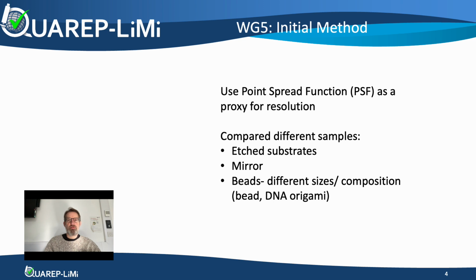Since we decided to use such a measure to follow resolution, in line with the published confocal ISO, we have tested different samples to identify something that would allow us to record the data we need, and we're working to identify the metrics that will allow us to best characterize the data. We deliberately aimed to do this for point scanning and spinning disk confocals initially, so as to identify the crucial parameters required for robust QC.